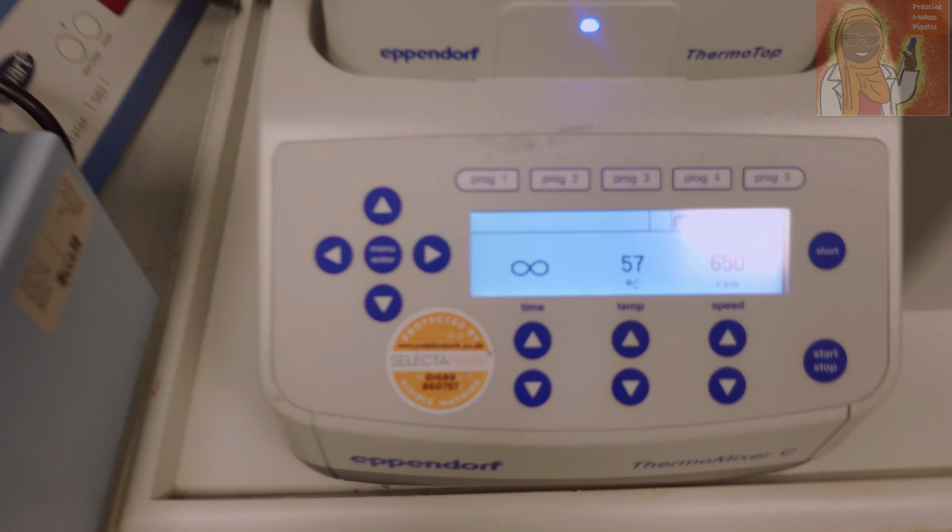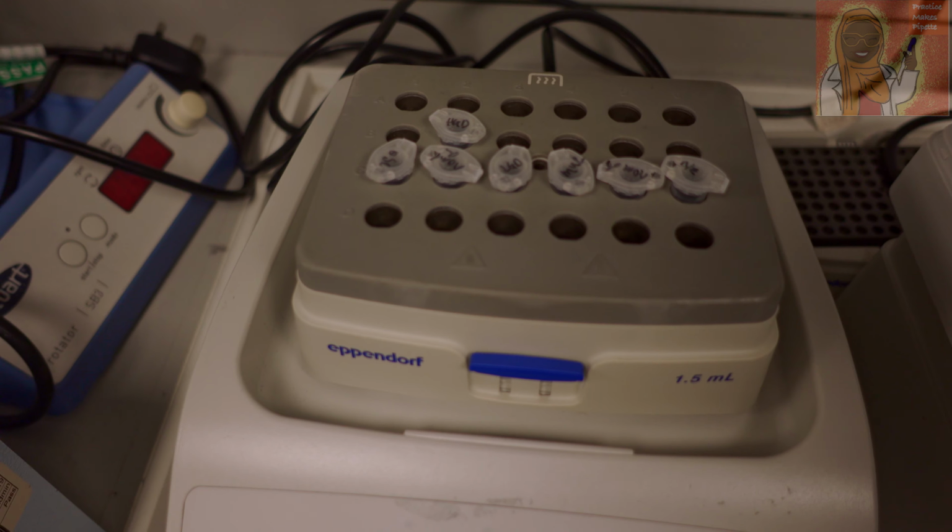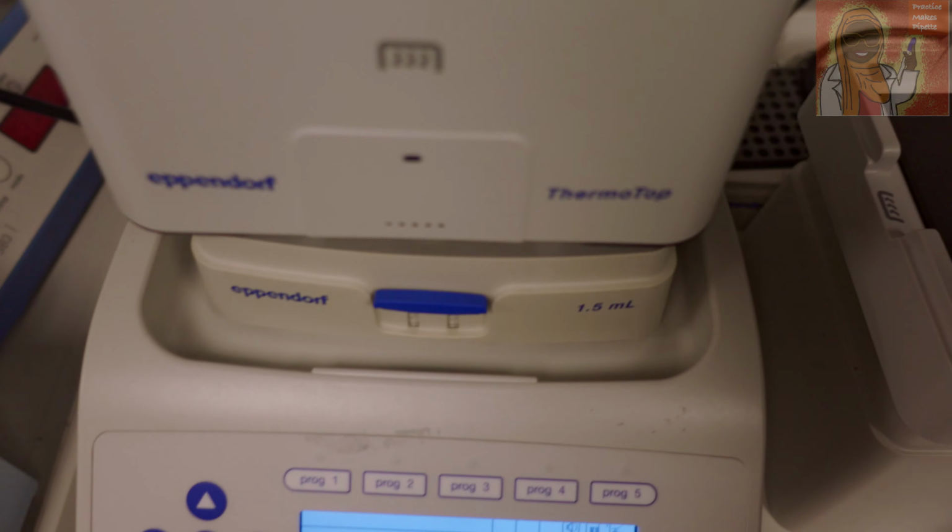Hi guys, so it's currently 7:39 and I've just finished with all of the preparation I was making for tomorrow's DNA extraction, and I've also labeled the tubes and prepared all of the things that I need for tomorrow's microdissection. So I'll show you in a bit all of my baby samples. I've got them in here at 57 degrees. I microdissected I think 7 samples today, and about 50 slides, and tomorrow as well I'm going to microdissect another batch of 50 slides, and again on Wednesday, Thursday, up until Friday.